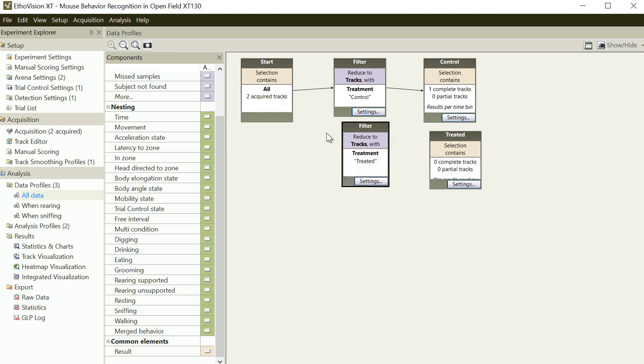So we have to make arrows in between. What we need to do is to press left click here and drag the pointer into here and release. So the arrow is automatically made. Click, drag, release. So we have two kinds of result container box like this. Okay, and this is the new algorithm, and the blue one shows that this is selected right now.